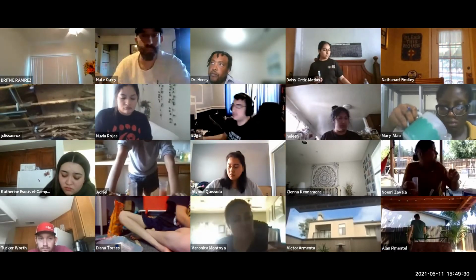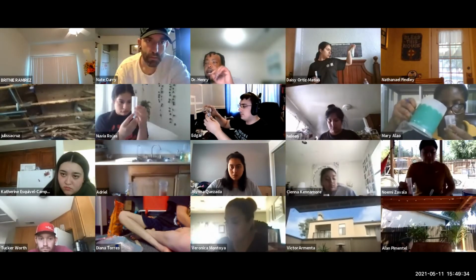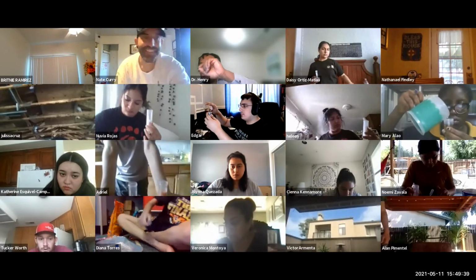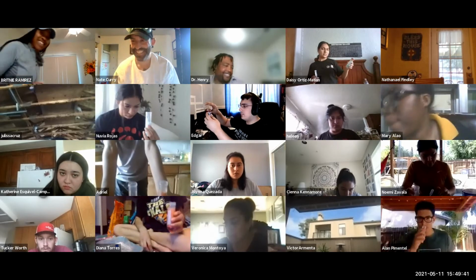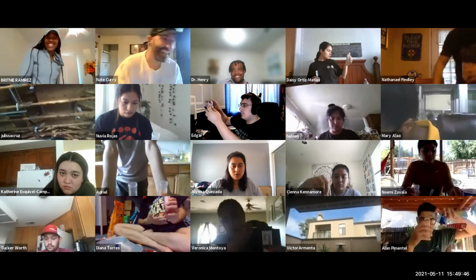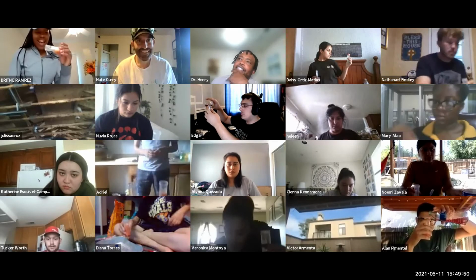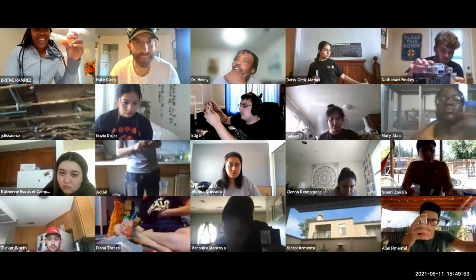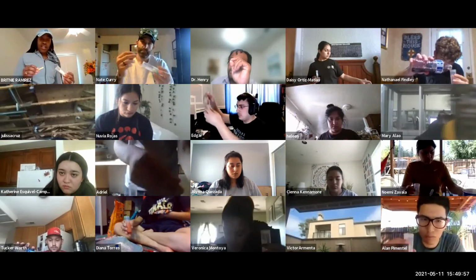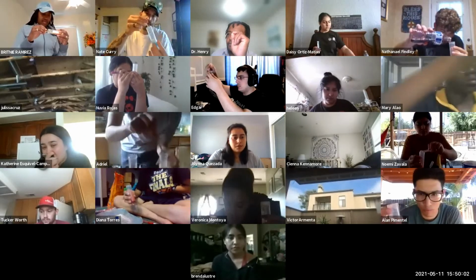All right. Wait, what are we gonna put our pH test strips in? So you want to, after you've done it, well, sorry, where's Brittany? You want to take some of that foam. Brittany, don't toss it. I thought you decided to do it again. All right, so wait. If it's in a sink, do you have a little bit of foam left in there? Yeah, I have a little bit. Okay, that's all you need, a little bit, right? So now what you need to do is put your test strip in there, just a little bit of your test strip in there.